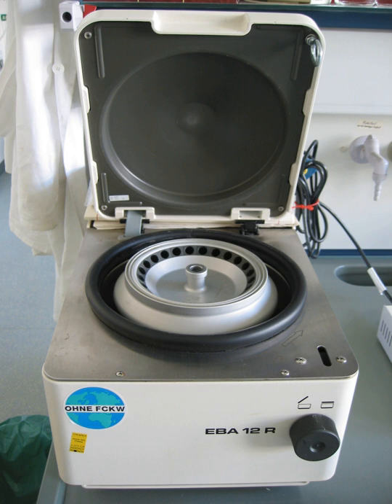Microcentrifuges typically accommodate disposable plastic microcentrifuge tubes with capacities from 250 microliters to 2.0 milliliters. Glass centrifuge tubes can be used with most solvents, but tend to be more expensive. They can be cleaned like other laboratory glassware, and can be sterilized by autoclaving. Small scratches from careless handling can cause failure under the strong forces imposed during a run. Glass tubes are inserted into soft rubber sleeves to cushion them during runs.